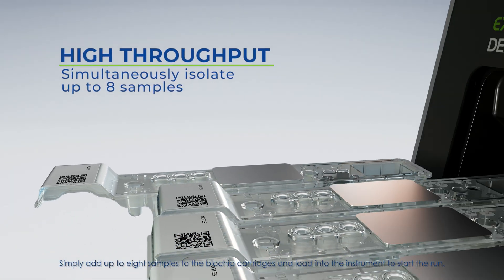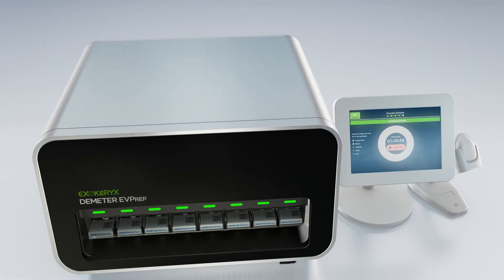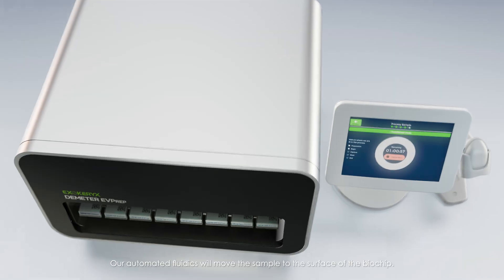Simply add up to eight samples to the biochip cartridges and load into the instrument to start the run. Our automated fluidics will move the sample to the surface of the biochip.